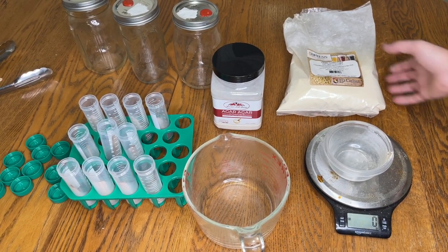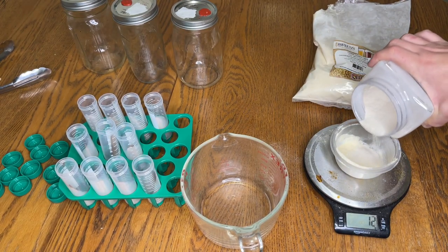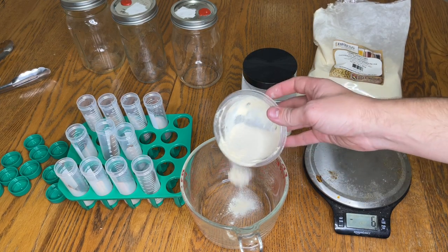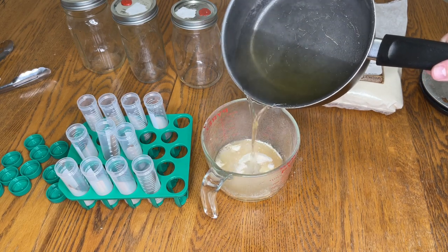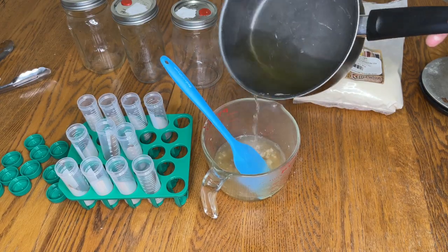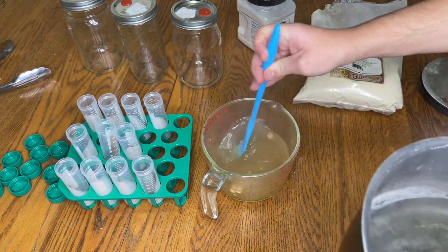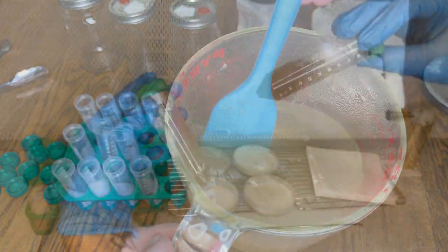Now we are going to weigh up 10 grams of light malt extract powder and 10 grams of agar agar powder. 500 milliliters of the boiling water is slowly added to the powders and stirred until completely dissolved. It is important to make sure the water is near boiling during this step, or the culture slants will end up not solidifying completely.